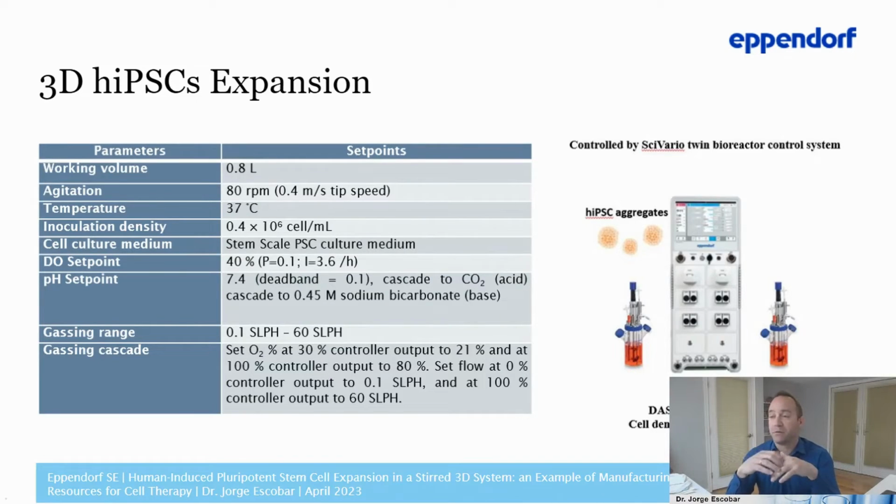After we assemble the bioreactor, we sterilize them and place them back into their respective temperature control block to keep the system at constant temperature. Then we have connected the drives, the Peltier exhaust condenser, and also the sparge line coming from the controller directly into the submerged sparge filters on the vessel.